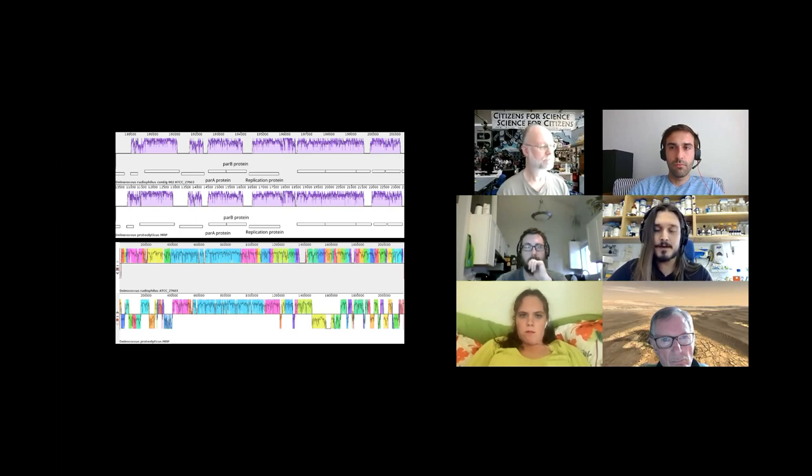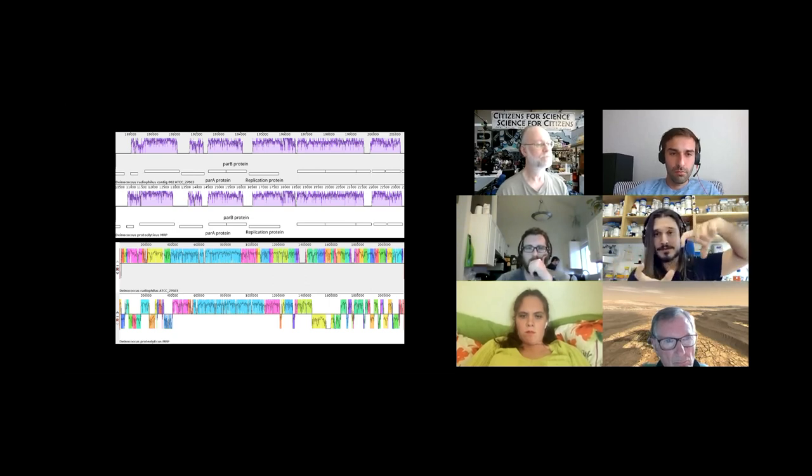And after a bunch of polishing with our genome, you can actually see the colors match the colors in the image, the second image down there. The colors match the homology regions, right? So the top bar is our radiophilus, and on the bottom is proteolyticus, and those little blocks start to coincide. This isn't the actual chromosome, these are plasmids from these two microbes.